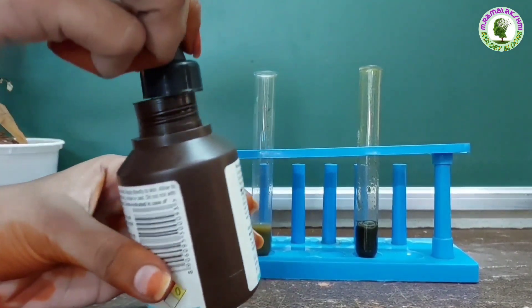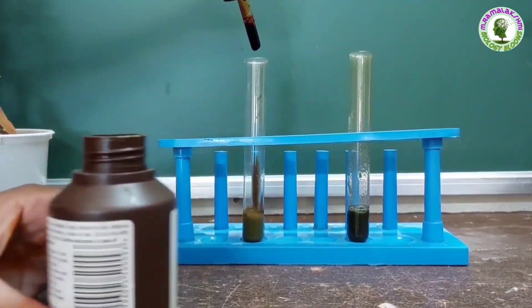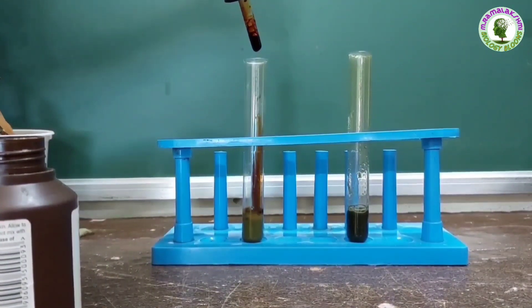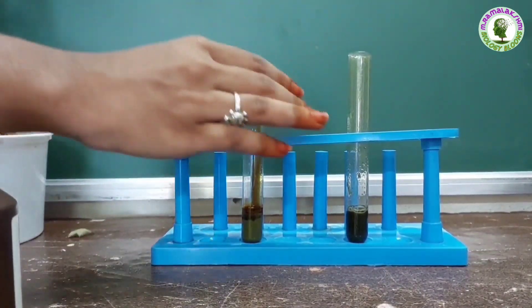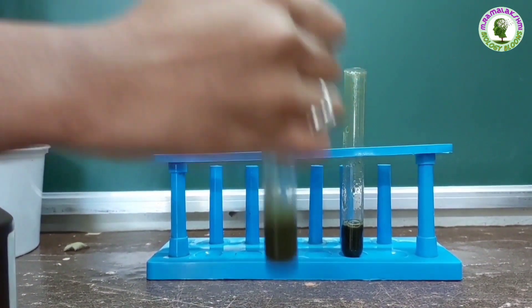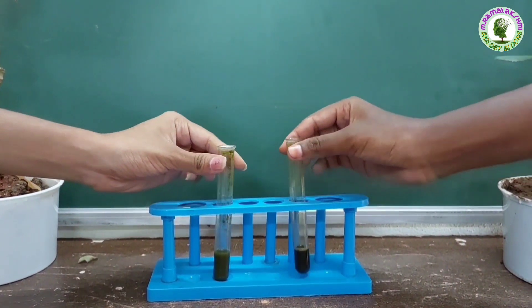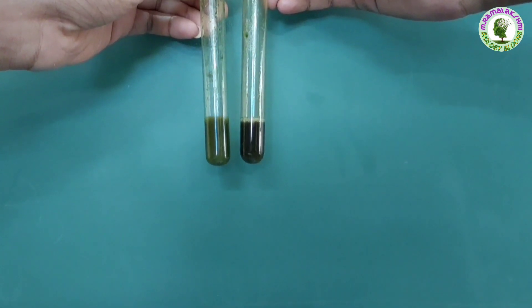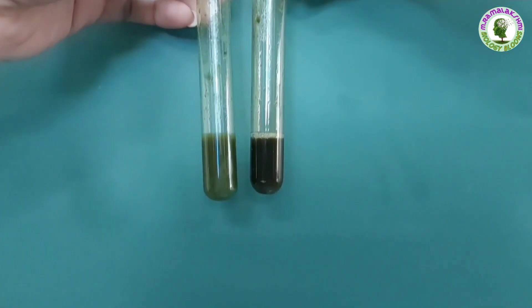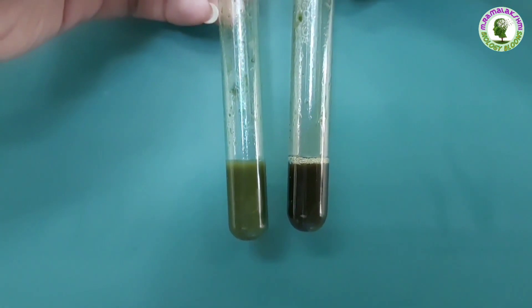Now add the same amount of iodine drops to the leaf extract of the plant kept in dark. Observe, children — is there any color change in this leaf extract? No, the leaf extract has not changed into the blue-black color. So there is no starch in it.